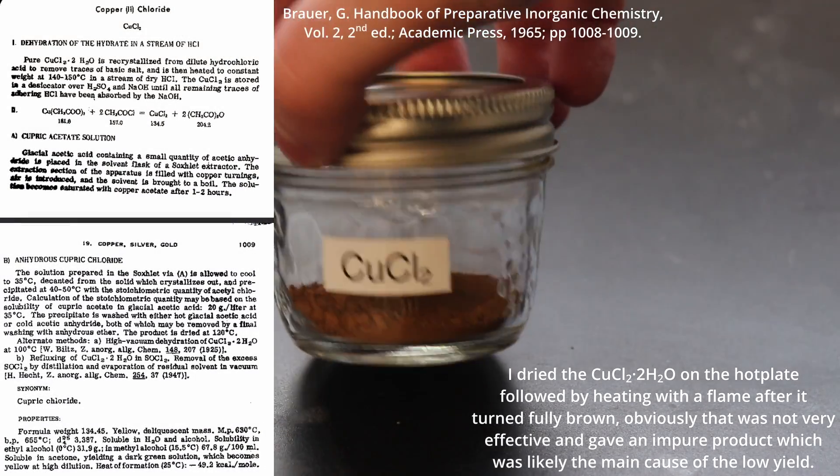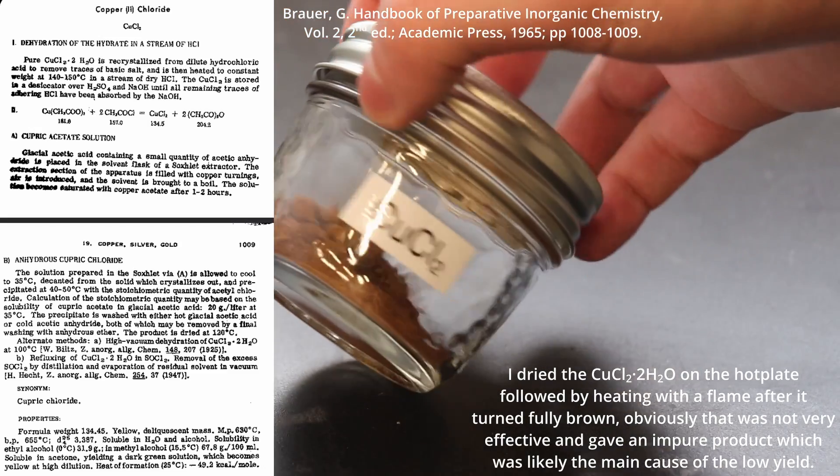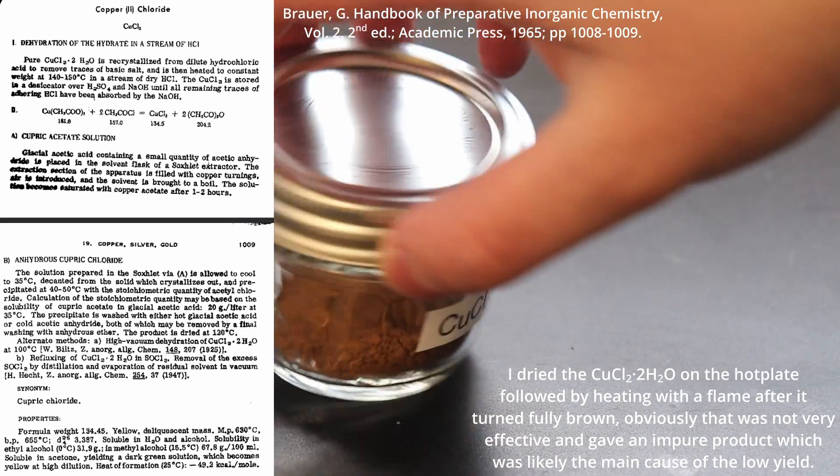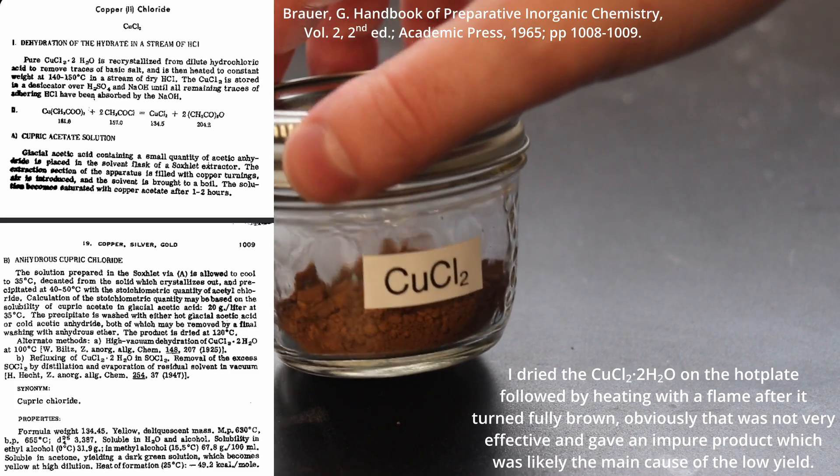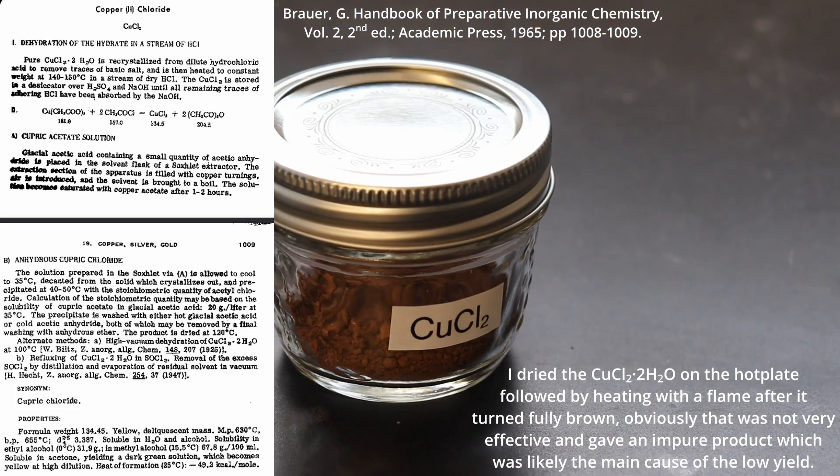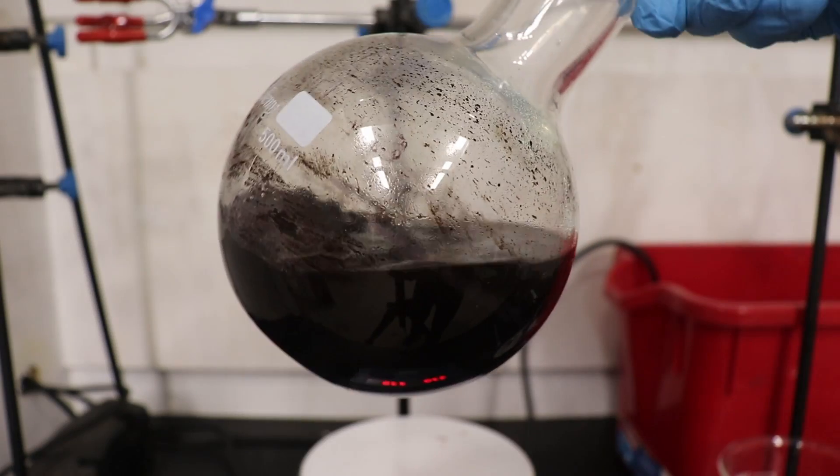The main determiner of yield is likely the purity of the anhydrous copper chloride. Any residual moisture will destroy the phenylmagnesium bromide leading to a significant reduction in yield. Also the handling time in air needs to be minimized as it is very hygroscopic and will fairly quickly turn back into the dihydrate. Also care needs to be taken when drying the copper chloride dihydrate, as excessive heating will lead to the formation of copper oxychlorides and hydroxychlorides which can also destroy the phenylmagnesium bromide as well as throw off your stoichiometry.